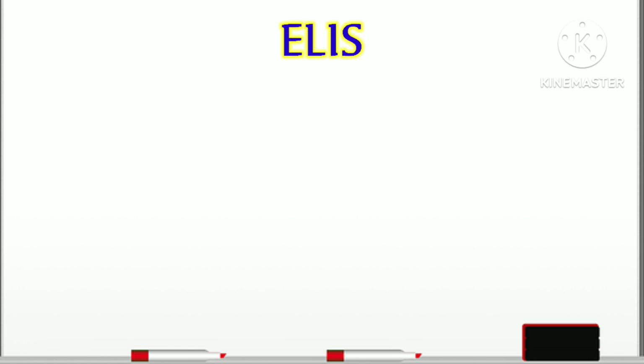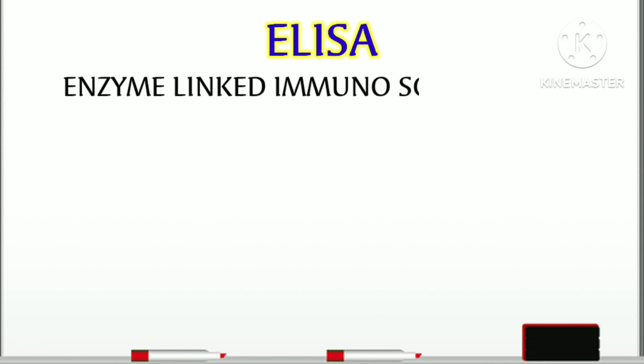Today's topic of the discussion is about ELISA. What is the full form of ELISA? Enzyme linked immunosorbent assay. I define each of the terms one by one.